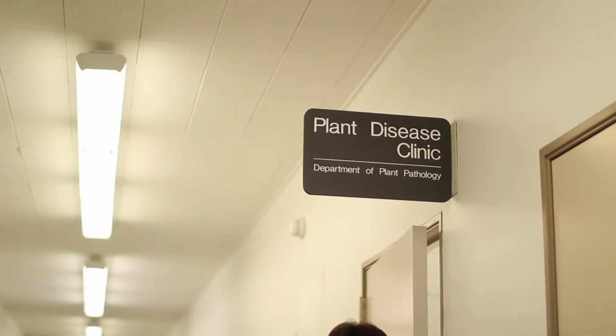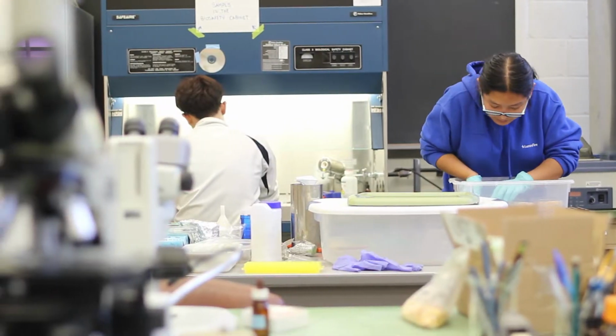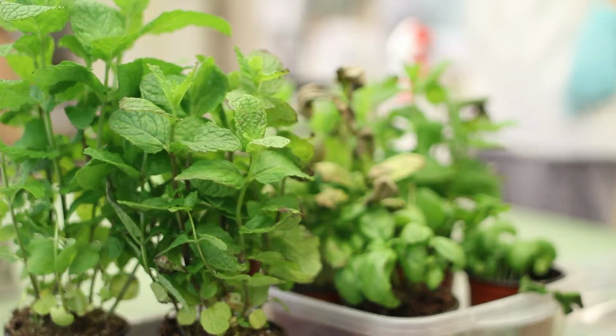I am the director of the Plant Disease Clinic in the Department of Plant Pathology at the University of Minnesota. The Plant Disease Clinic is a service lab that diagnoses plant disease from samples submitted by government agencies, farmers, professional horticulturalists, as well as the general public.